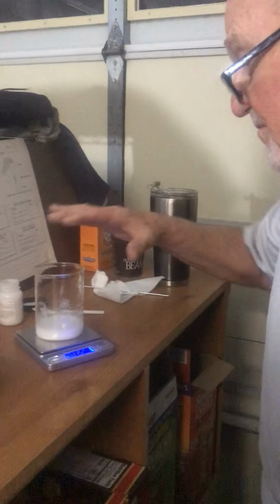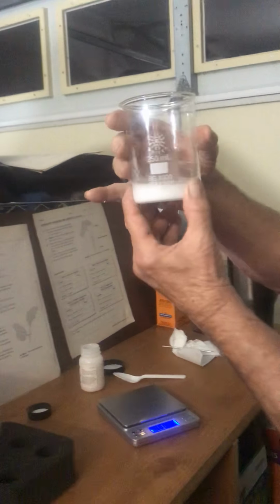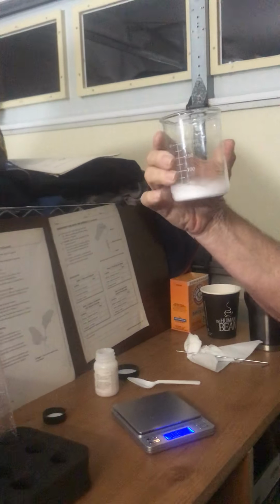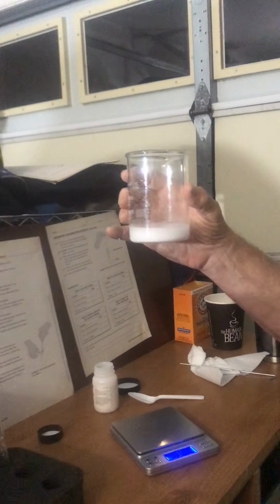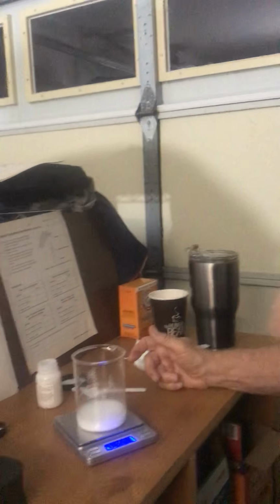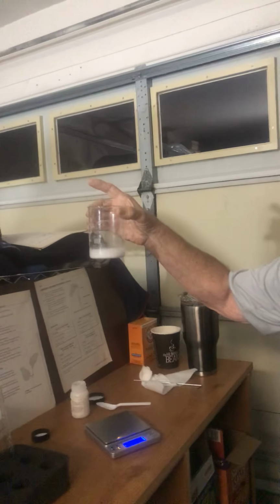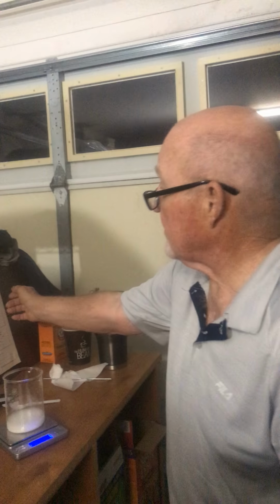So it's actually losing a little weight, because the bubbles are going up into the air as carbon dioxide and other gases as these combine. That is a classic example of a chemical change, when you have gases come out, just like when we had the antacid, very similar to that, isn't it? Okay, there you go. And you're going to input that on our 4 labs that we're doing.